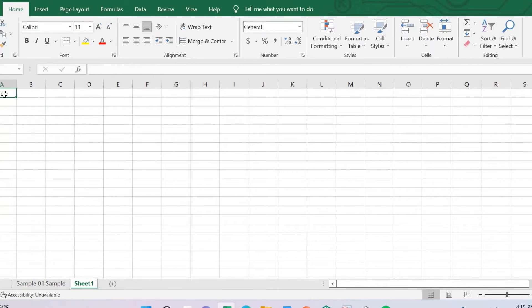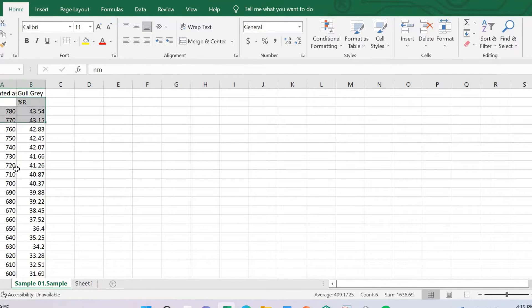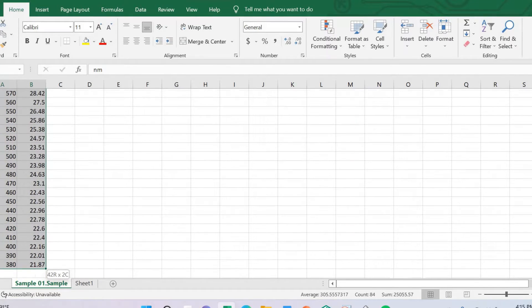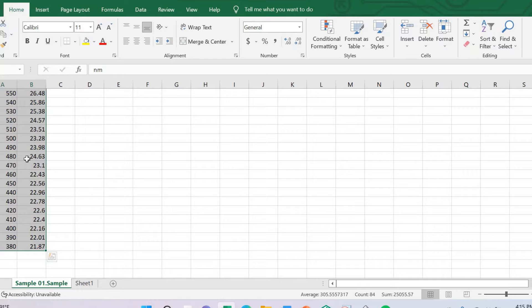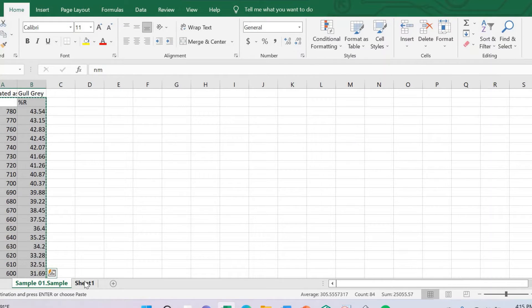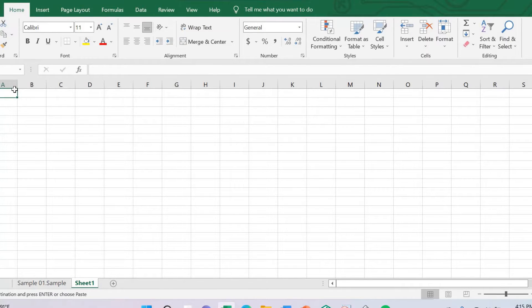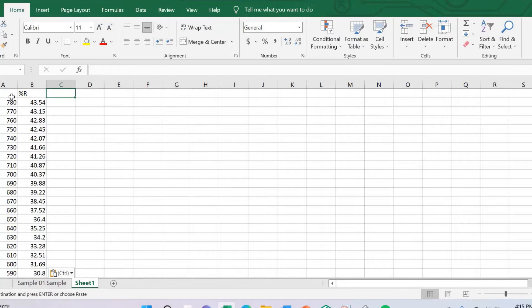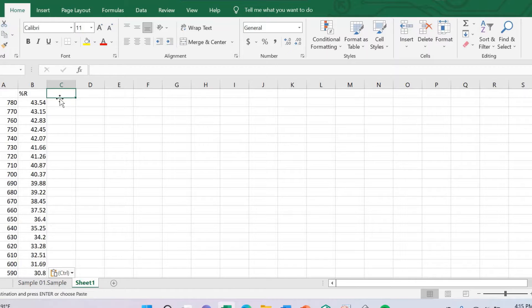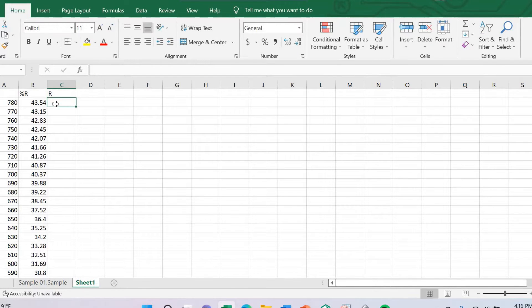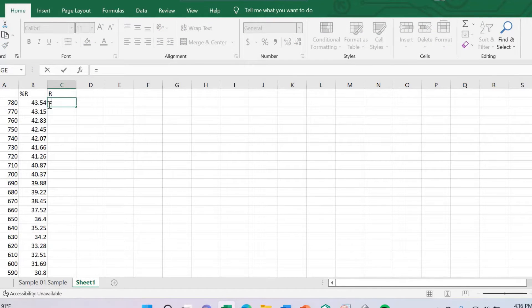Just open a new Excel file and copy this data. Go to the new Excel file and paste it. This is my wavelength and this is reflectance. Now I can convert this reflectance into R — this is the percentage, but we need only R, so we divide R by 100.